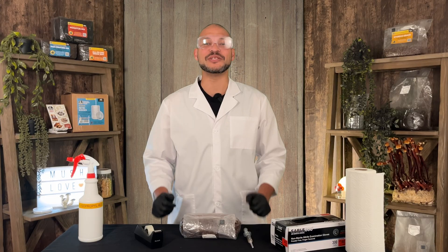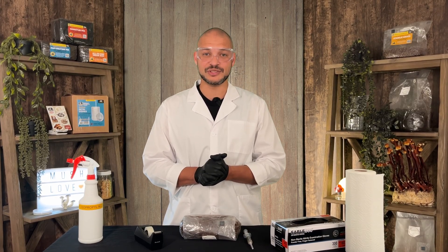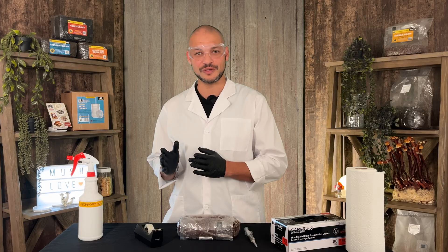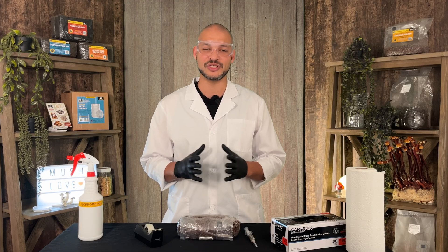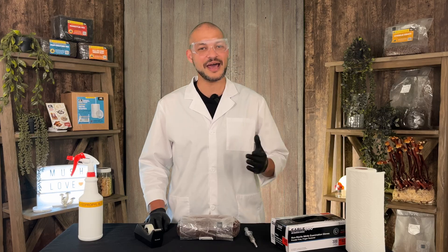If you're inoculating multiple bags, you can sterilize your syringe with a torch between inoculations — but be sure to let it cool completely. After that, store your inoculated grain bag in a warm, dark place between 70 and 75°F. Over the next one to two weeks, mycelium will spread throughout the grain. While liquid culture is a great method, always inspect it before use — your solution should be clear. Cloudy liquid culture can indicate contamination, which will compromise your grain run if injected.